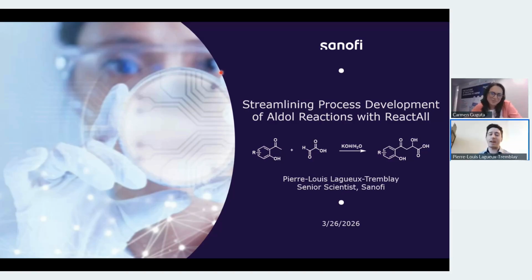Yeah, exactly. The good news is that the one shown here was a homogeneous reaction, but I did work with other transformations that were heterogeneous. And for the most part, I was surprised it was very reliable. Even, for example, with an organic solvent and an inorganic base, you will have the sample, it will work. And I never saw any issues with heterogeneous for the most part.